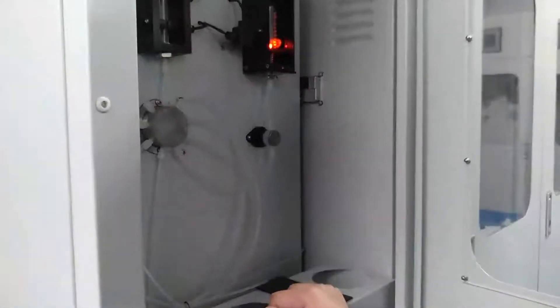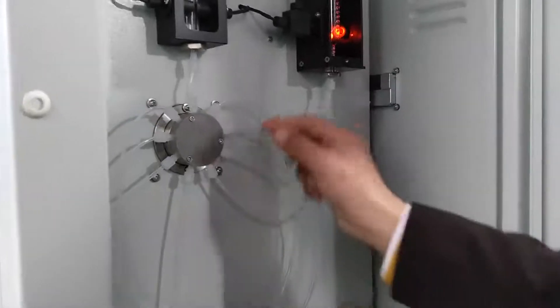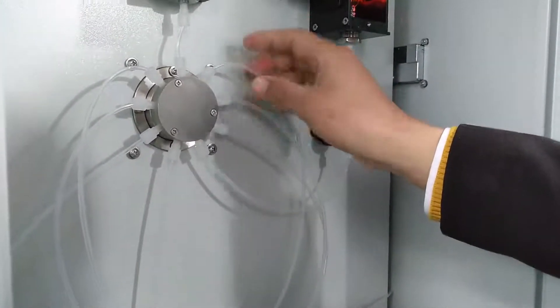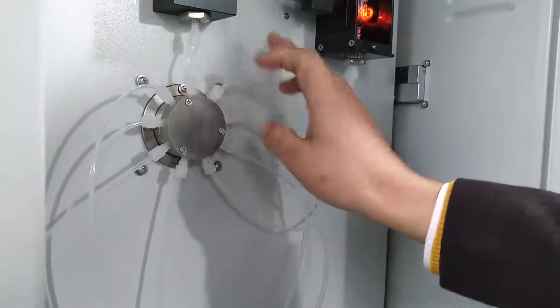The first step, before the calibration: firstly, you should ensure the pipe is filled by the liquid. The pipe must be filled by the liquid.